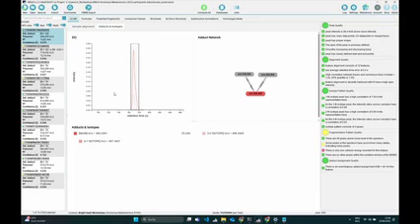No, right now it's not like you are uploading your data. Right now, the custom databases are locally on your system, so it's the SIRIUS DB file, and during import, we compute everything we need to search in this database. Then it stays on your system, and you can share the file with your colleagues, but there is right now no server storage for your structures.